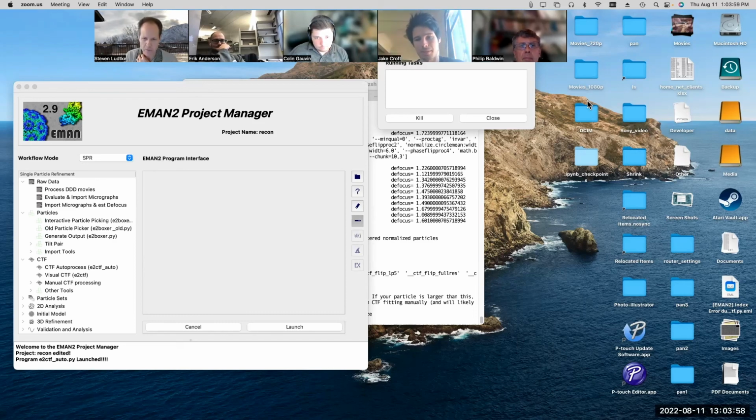So then you could do it very easily. Just modify the program that we made last week and make it so you basically make a tilt series for each particle. If you wanted to use that data in the EMAN2 single subtomogram averaging pipeline, you would have to generate a simulated 3D particle and a simulated tilt series for each simulated particle.